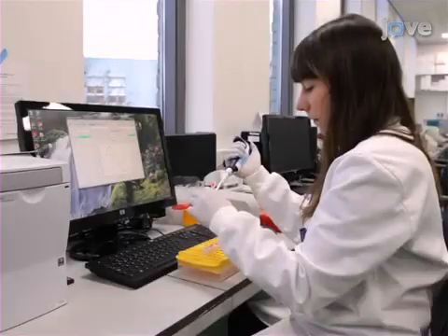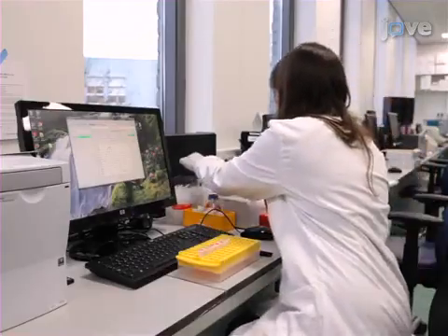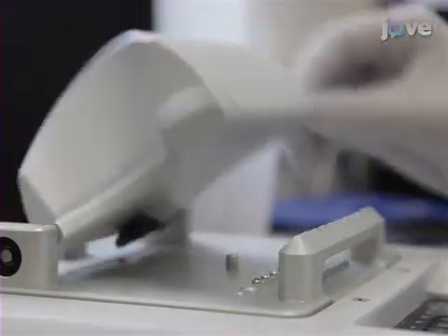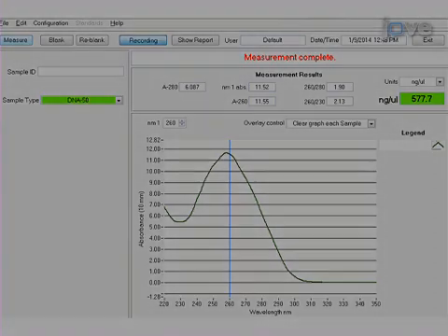To begin, create the plasmids as described in the text protocol. Estimate the concentration of them based on absorbance at 260 nanometers. Determine the molecular mass of each plasmid by multiplying the number of base pairs by 650 Daltons.